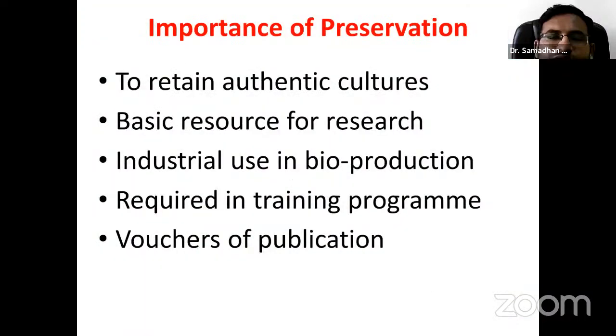What is the importance of preservation? To retain the authentic cultures. It is a basic resource for research, as various students and researchers require these cultures. Then industrial use in bioproduction, like bioethanol production or production of industrially important enzymes like amylase.